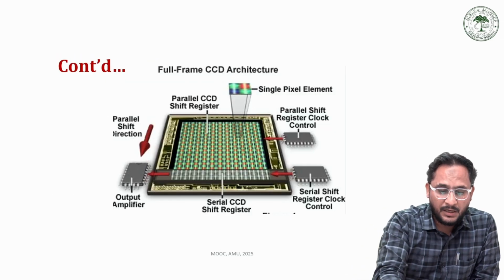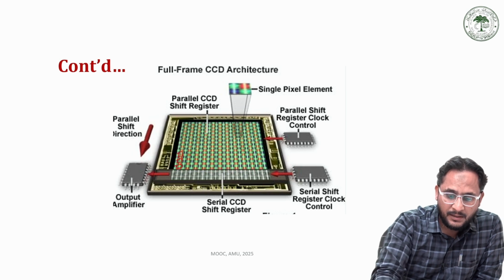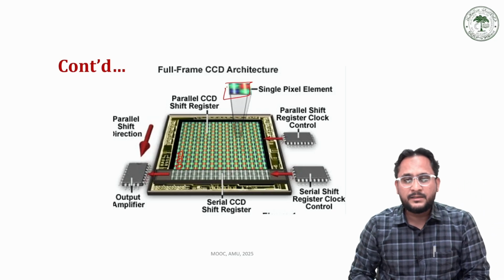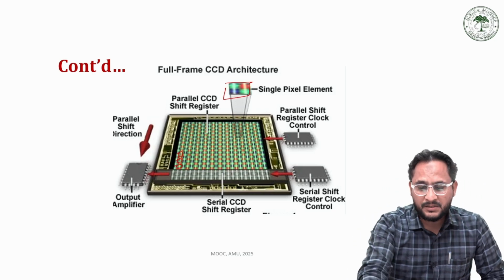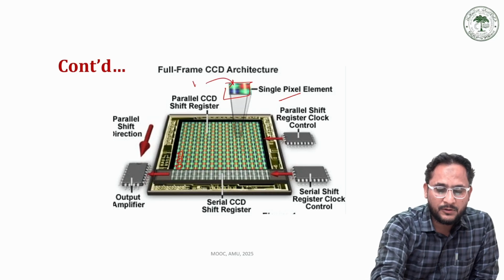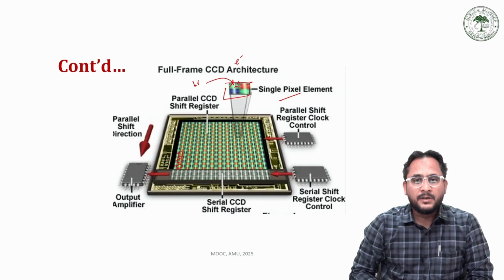So this is a type of solid state array detector where we have different light sensitive elements placed, or light sensors. These light sensitive elements, sometimes called pixels, when they receive light photons h nu, create electrons that are ejected, and then we have holes remaining.